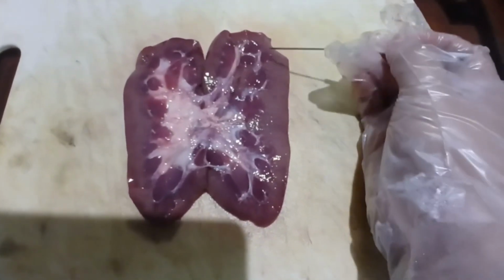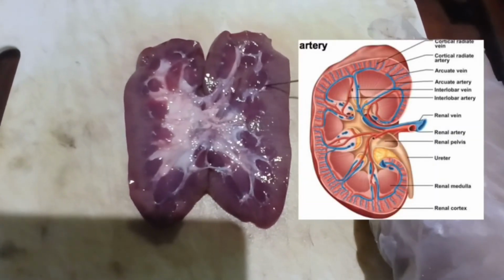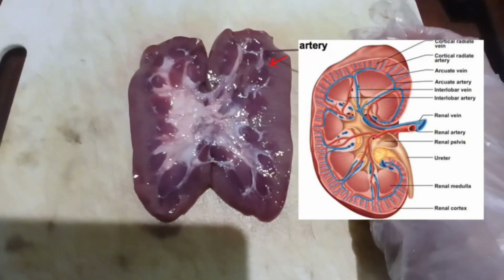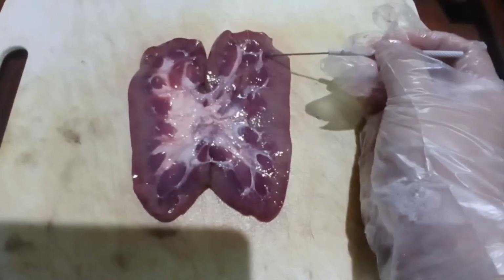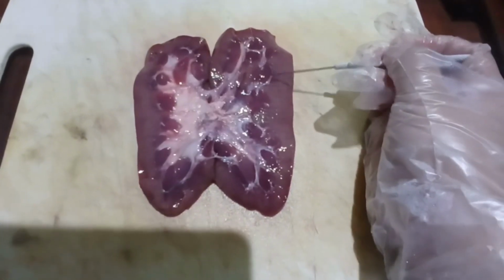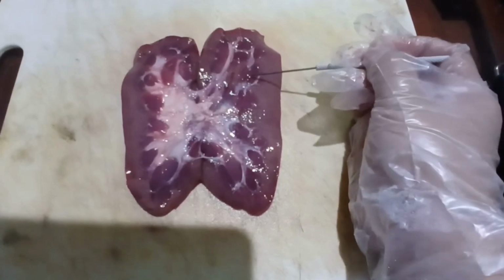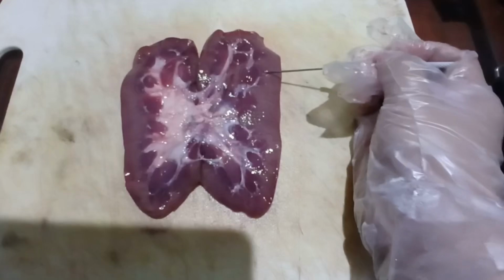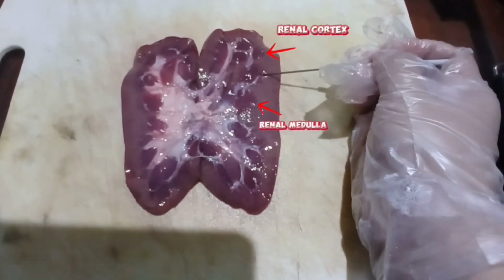Next, we have the arcuate artery. The arcuate artery is at the base of the renal pyramids, which they arch over. Like the others, the interlobar arteries branch off, and here they become the arcuate arteries. These arteries are located between the renal cortex and medulla, as you can see over here.